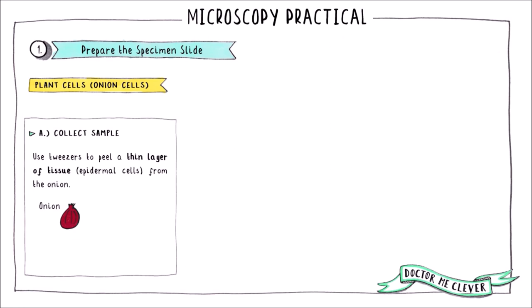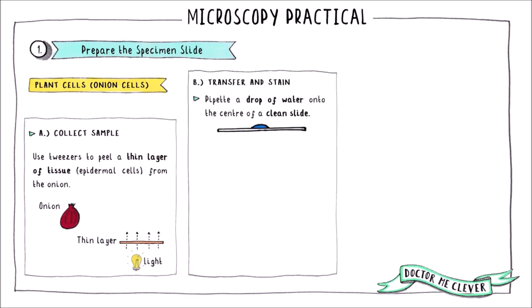First, let's look at preparing a sample of plant cells — in this case, we're going to use onion cells. You need to peel a thin layer of epidermal tissue from a small piece of onion. This layer needs to be very thin so that light can pass through the sample and reach the lenses of the microscope. The next step is to transfer your sample to a clean microscope slide.